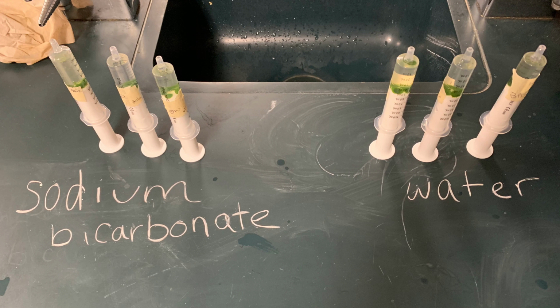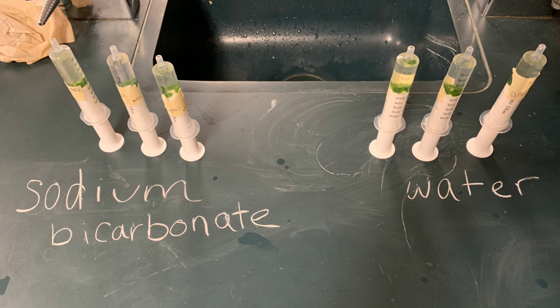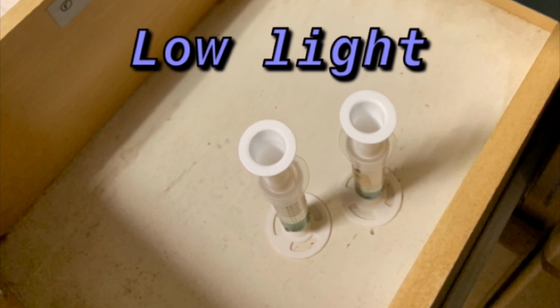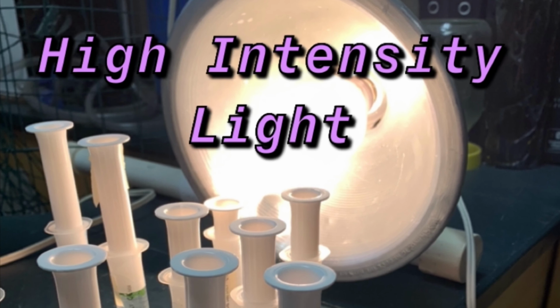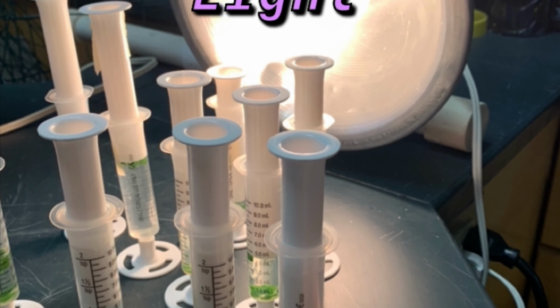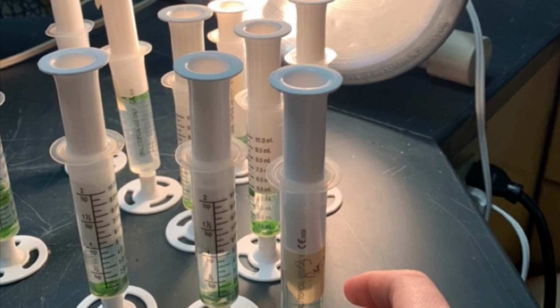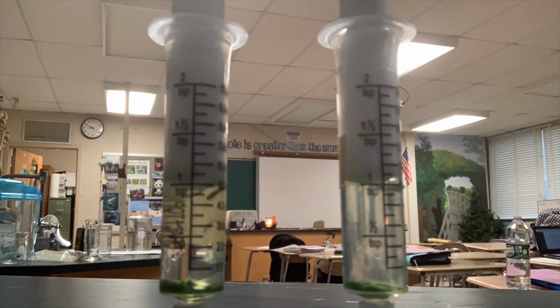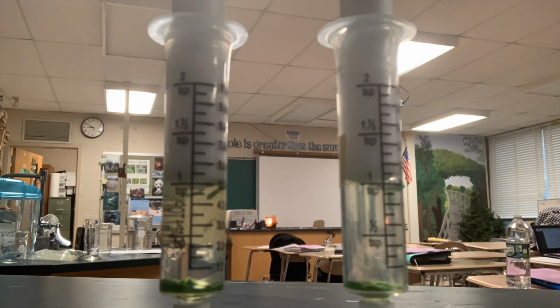Great job, guys! Now you will have to place 2 syringes in each environment. There will be 2 in low light, one of which will be water and the other which will be sodium bicarbonate. 2 in ambient light, again 1 water and the other sodium bicarbonate, and then again 2 in the high intensity light. Now you should visit your syringes every 2 minutes to see how many discs have now floated.